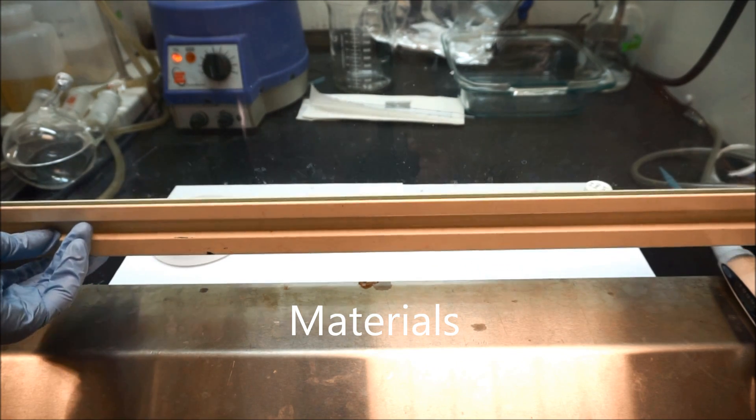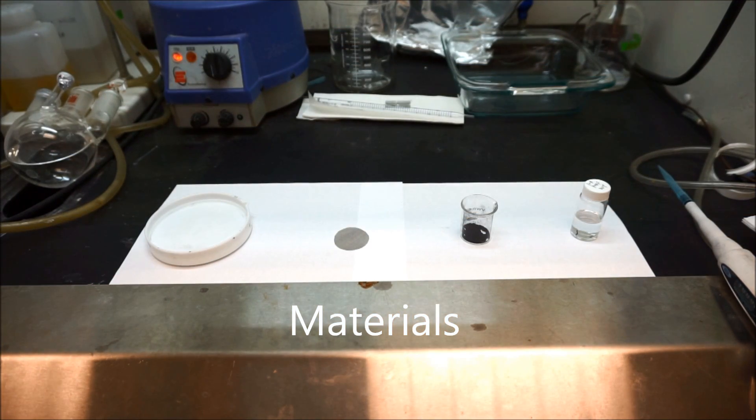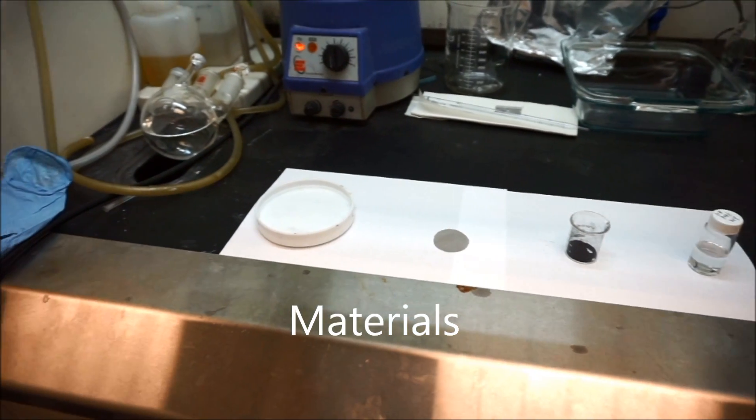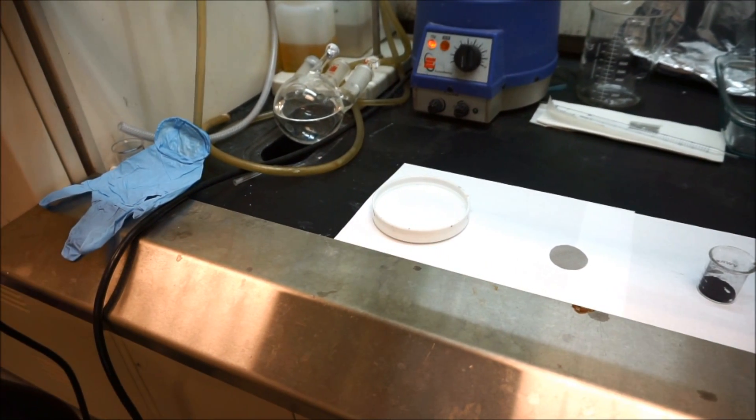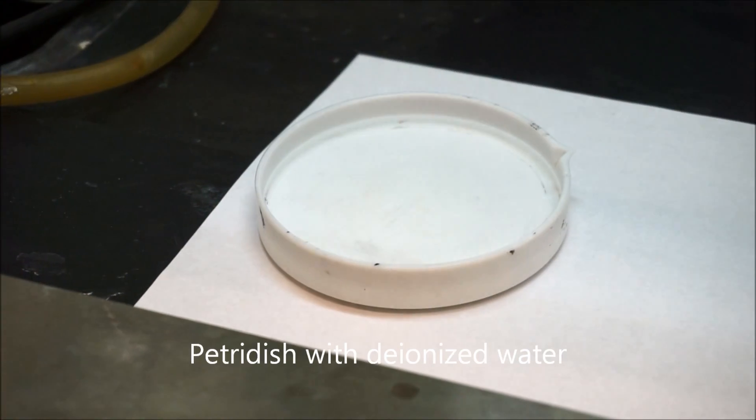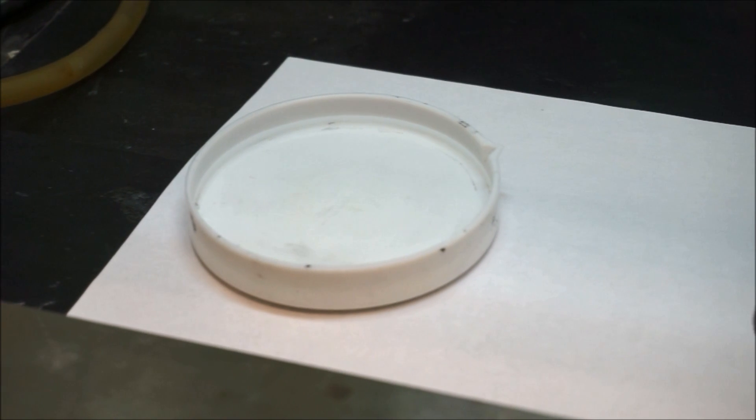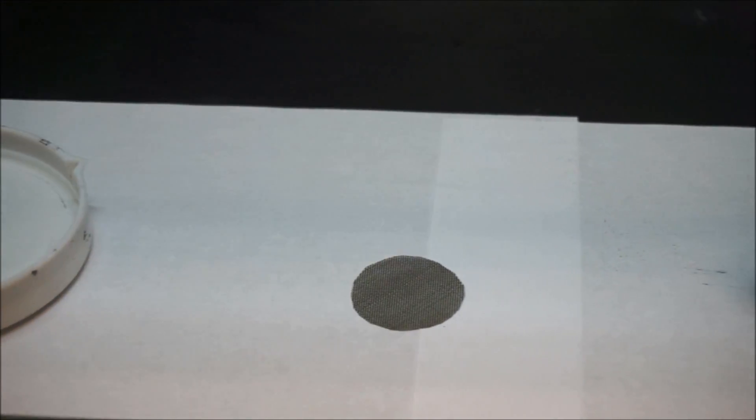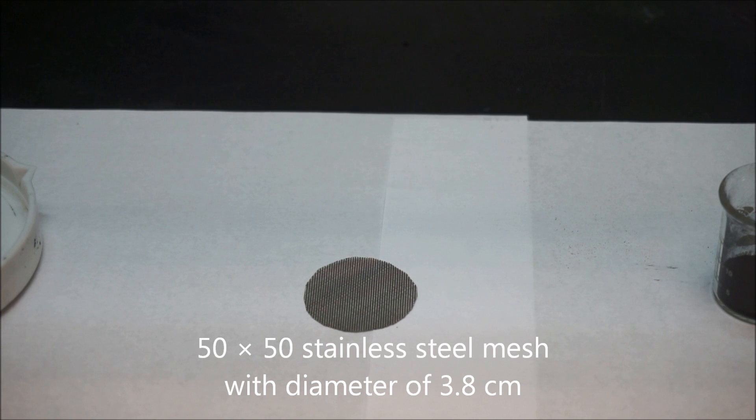So first let's take a look at the materials and the equipment we need to use to make the active carbon air cathodes. The first one is the petri dish filled with deionized water and the second one is the 50 by 50 stainless steel mesh as the current collector.